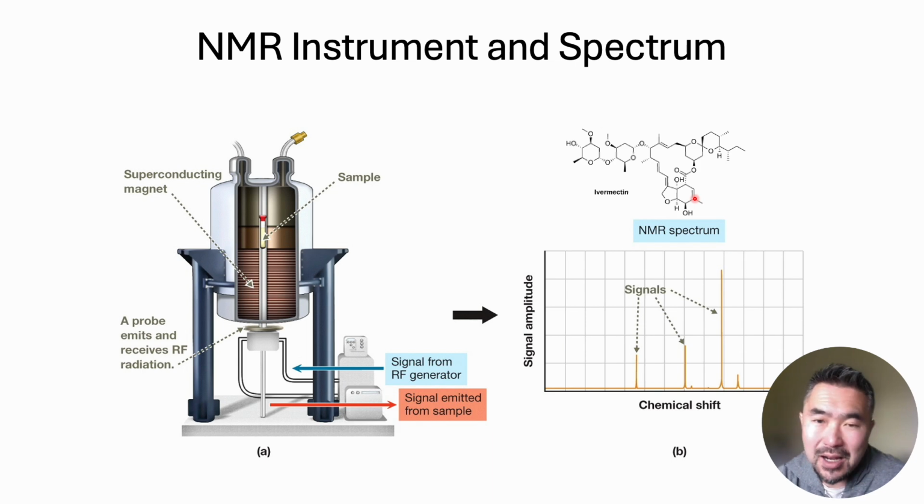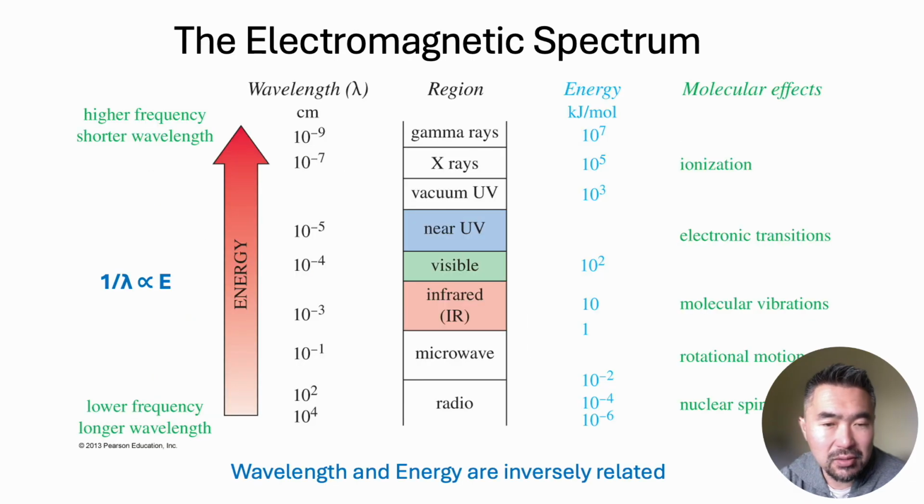Well, we're not going to be analyzing something as complex as this structure in this class, but we're going to be analyzing some compounds. And in our class, you will not just try, but you're going to be able to elucidate the structure of a completely unknown molecule by figuring out the relationship between each atom, which is really exciting. It's something so small you cannot see, but you can figure out what it looks like, right?